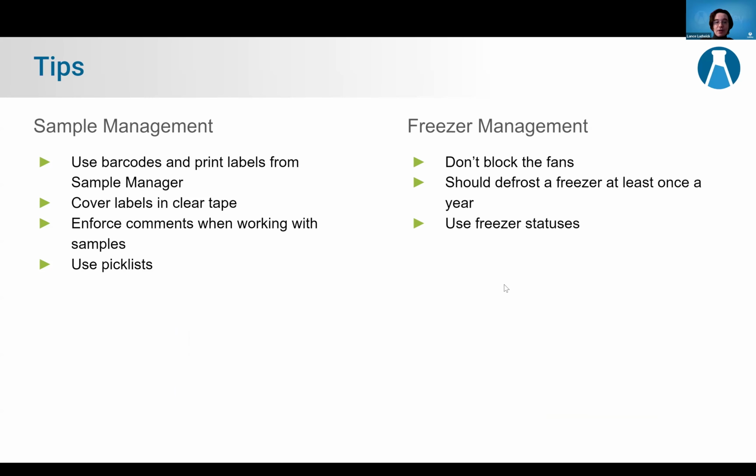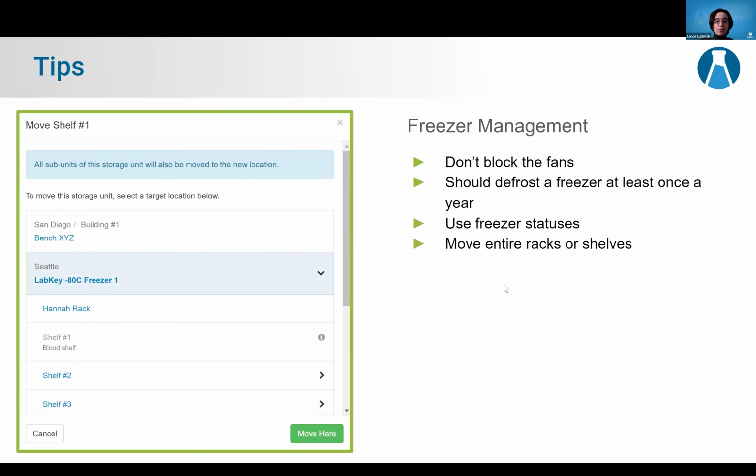And while a freezer is defrosting, we make it really easy to move an entire location within your freezer to another spot. So you can move an entire rack or an entire shelf to another location, keep all of your boxes and samples together so you don't have to move one box at a time. This can really help streamline your process and make freezer maintenance a little bit less painful.